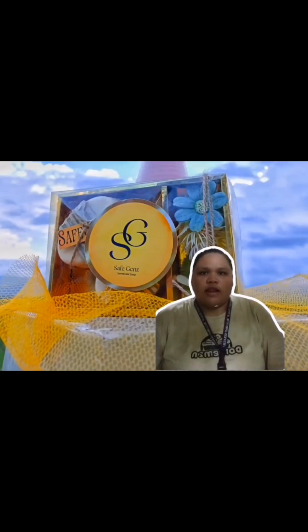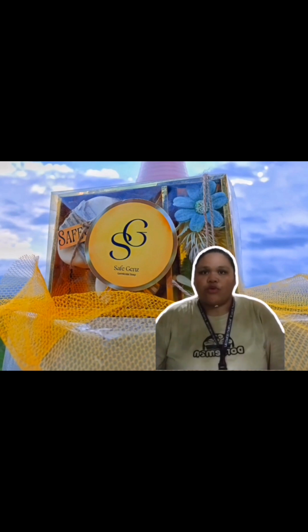Furthermore, we have learned and experienced how to make our own soap with gentleness and focus, precautions, and the correct procedures. Though it seems easy to make, we need to be extra careful in the process because not all liquids or solids are safe for our skin, especially the lye.